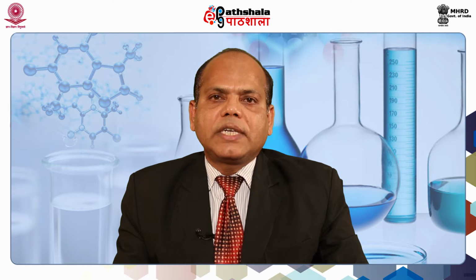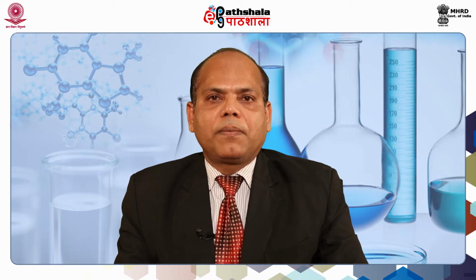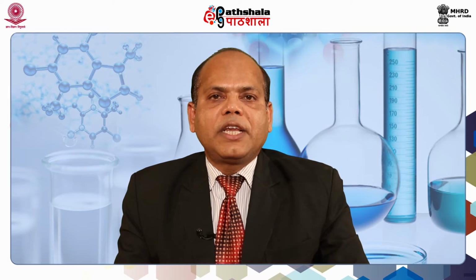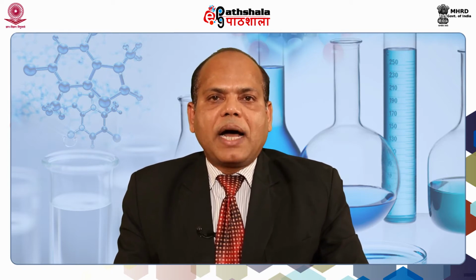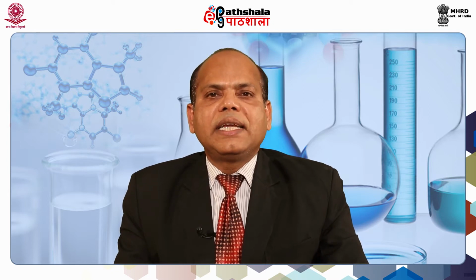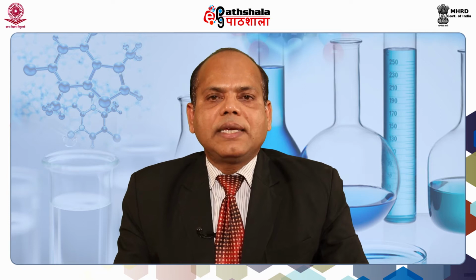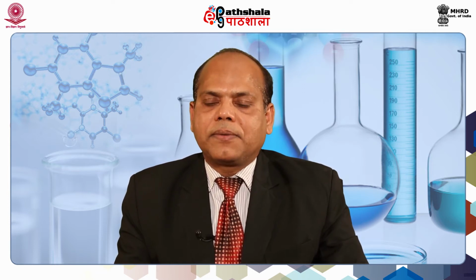As the name indicates, mass spectrometry means we are going to determine the mass of a particular molecule. Suppose, for example, we are talking of proteins. Protein is a polymer of amino acids. As such, the mass of this protein can be determined in two ways. First of all, to determine the intact mass. So, what is the exact mass of this protein? That can be determined by using mass spectrometry.